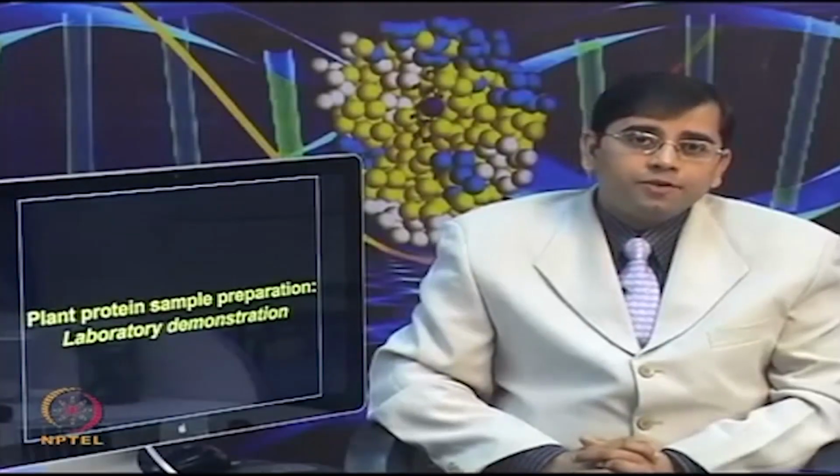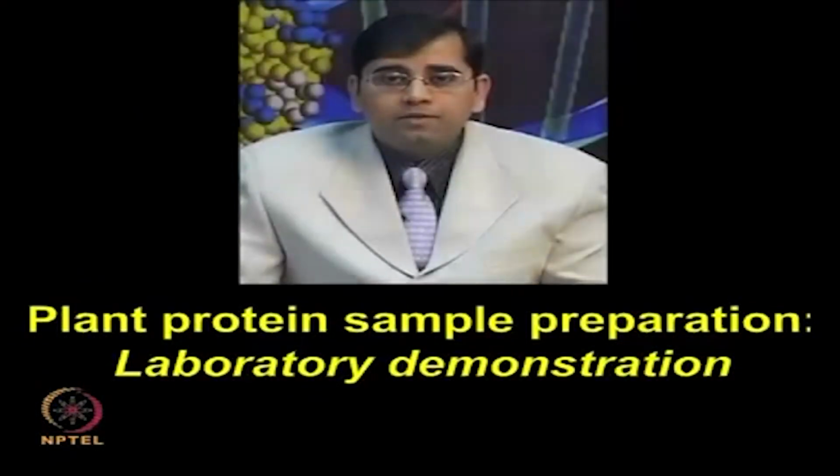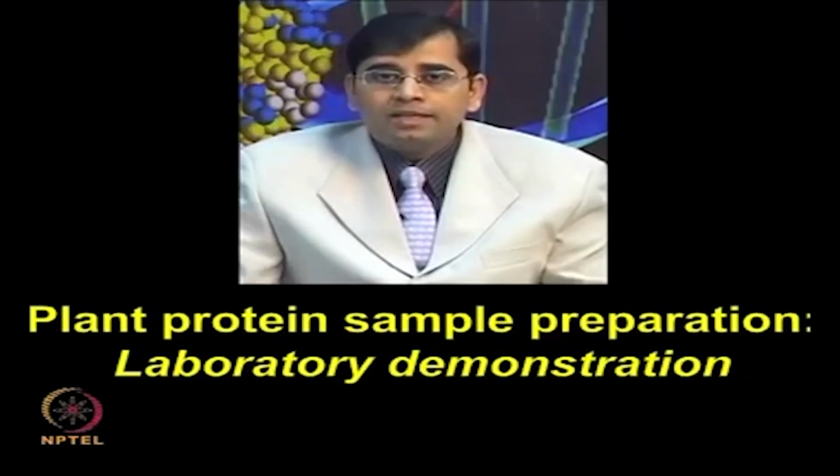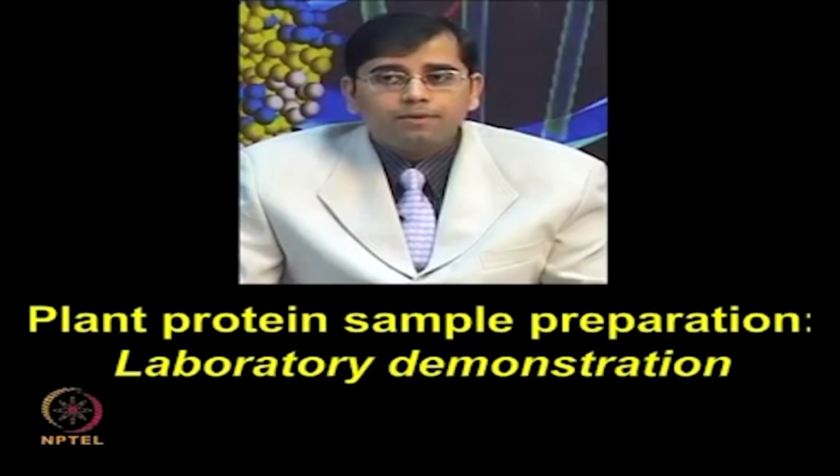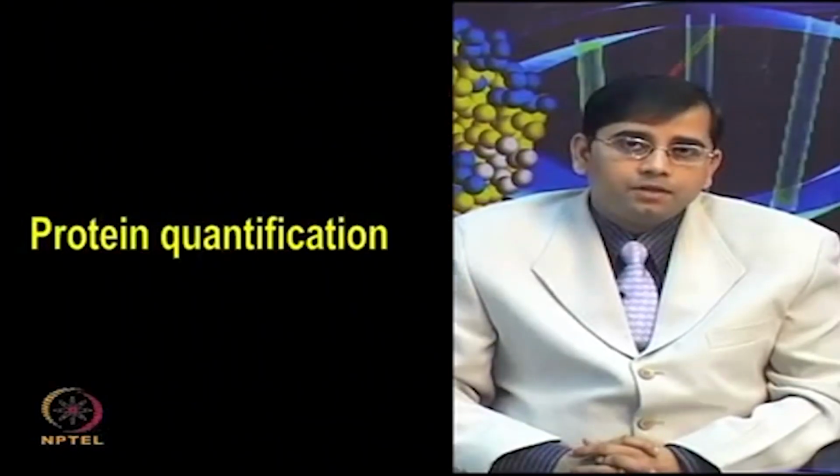Okay, so by watching this video, now you must be familiar with the TCA acetone precipitation method, how it can be effectively used for plant protein sample preparation. So, now let us move on to the next topic, which is protein quantification.